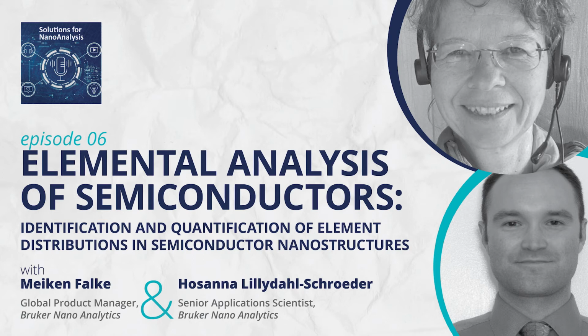Then there are people who say, oh, we just use imaging. The dark field contrast tells us where something is heavy and where something is lighter. But this also fails for 3-5 semiconductors and also for the mixture of elements which I mentioned before. Because as soon as you have more than one heavy and more than one light element mixed, it's difficult to judge just from the image where is which element. So for this, EDS is really ideal. It can use energy ranges of up to 80 keV, which is really difficult to do easily and quickly for EELS.